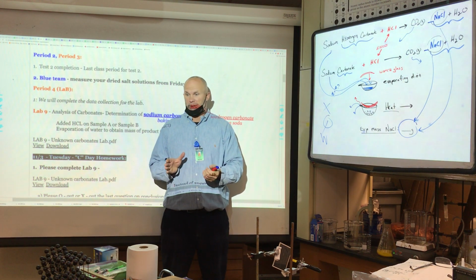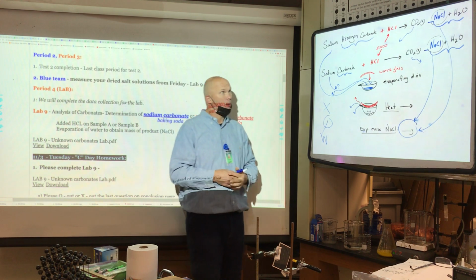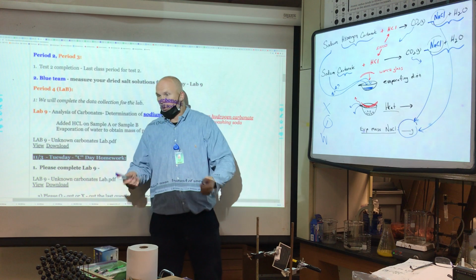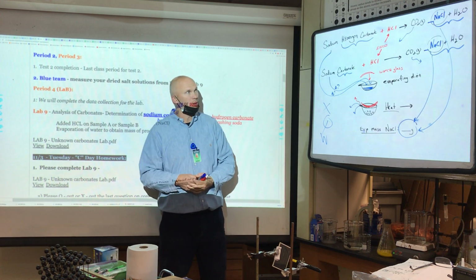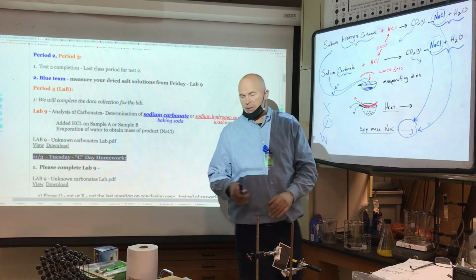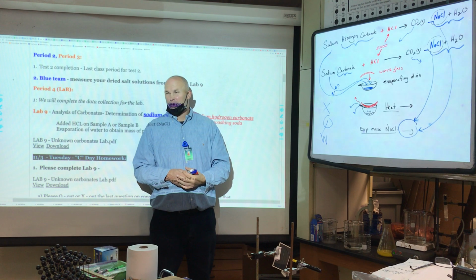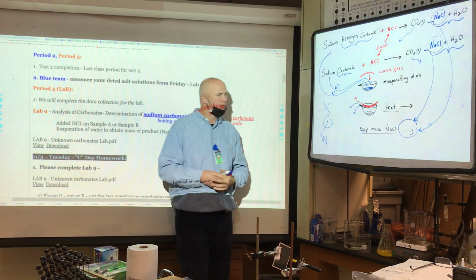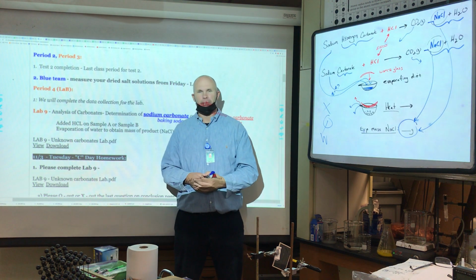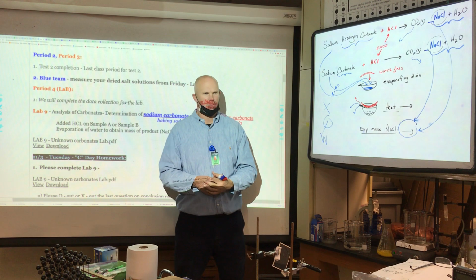For meat to not spoil, we would salt it or smoke it, okay? So we would go to the salt water in big pots and boil off the water and recover the salt, okay? So separating a solution by evaporation is an important separatory technique, okay? And it's a physical change. Now, number 3, to calculate the percent yield. I don't need a percent error, just a percent yield. And those are the 3 objectives.